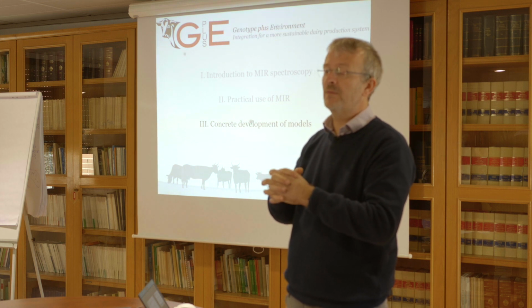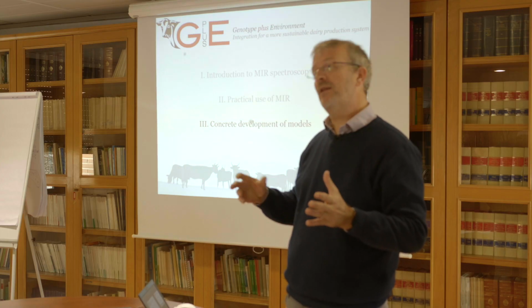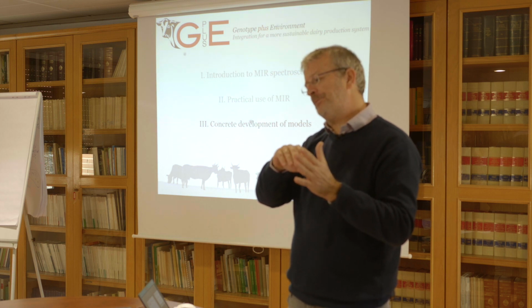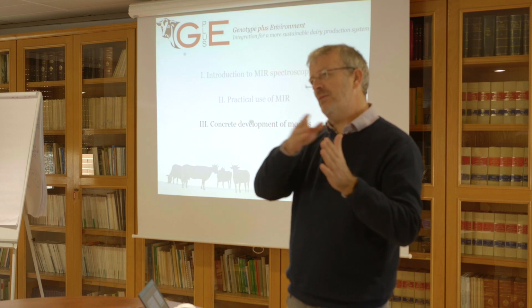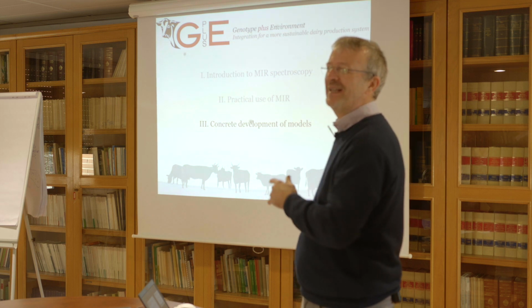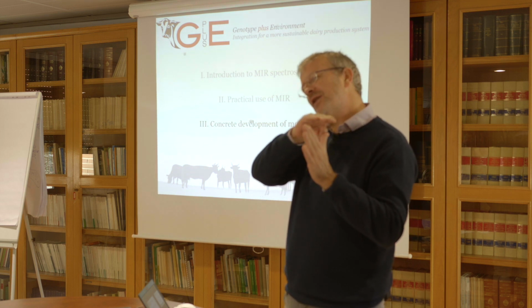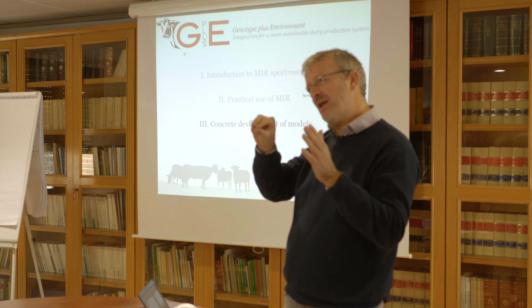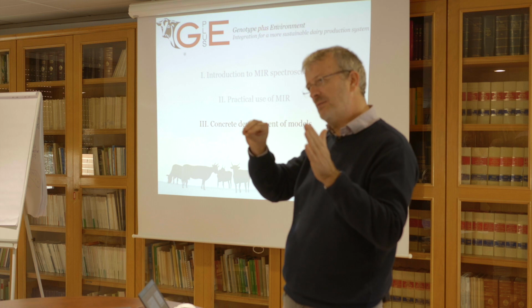No. And what happens if the conditions of the equipment change? If the same equipment? Yes, but in reality it's more complex than what I explained. In reality, we check by using other things. I don't explain everything. By using other things, we check if the apparatus that we use for the creation of the master have not changed.